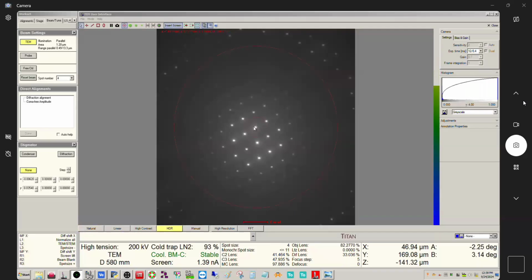Okay. So on my zone axis tilt map, I know that I want to use negative alpha tilt. Okay. So you can see right there. Whoops. Okay. And so I'm just going to get this in the ballpark here because what I'm going to do to fine tune this is I'm going to use a trick. Okay. So, this is in grayscale right now.